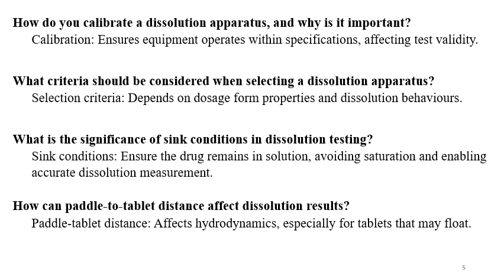How do you calibrate a dissolution apparatus and why is it important? Calibration ensures equipment operates within specifications, affecting test validity. What criteria should be considered when selecting a dissolution apparatus? Selection depends on the dosage form properties and dissolution behaviors.